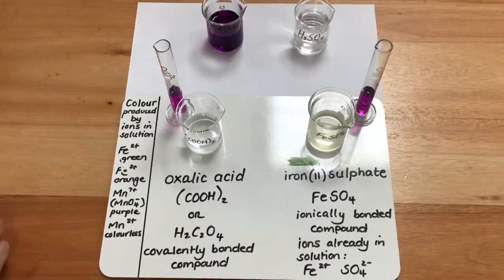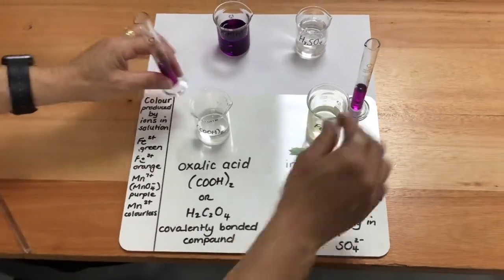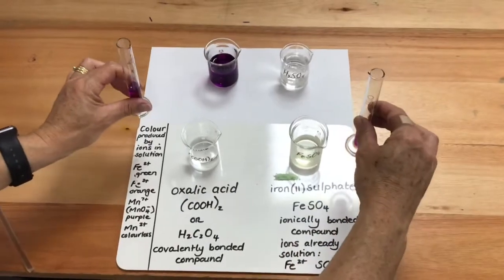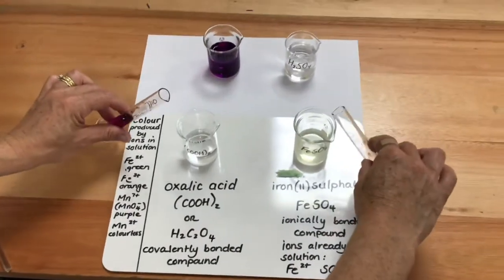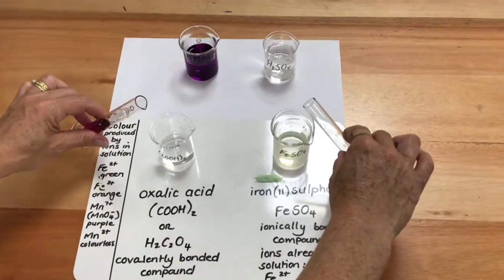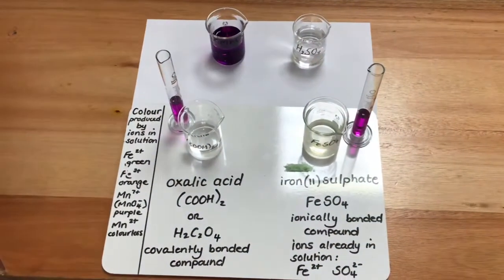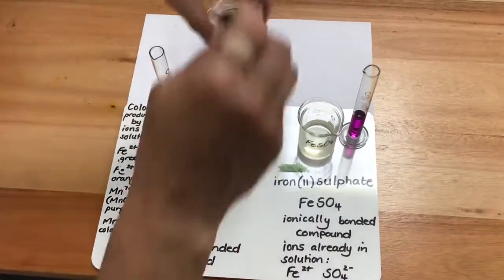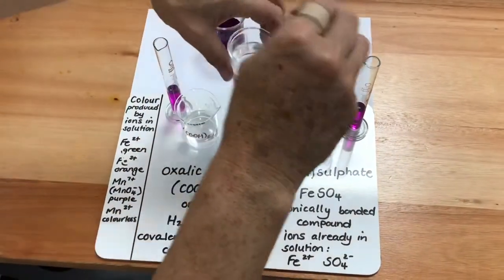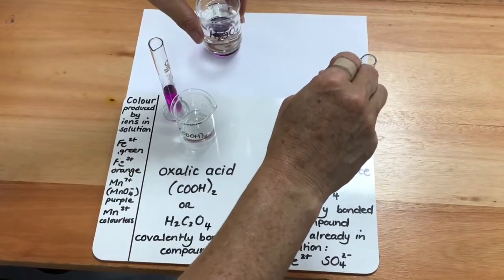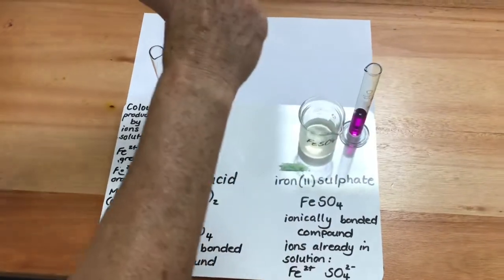I am going to add this potassium permanganate solution to each of these beakers simultaneously. But before I do that, I need to add a few drops of sulfuric acid to each beaker. I am adding 5 drops to each beaker.